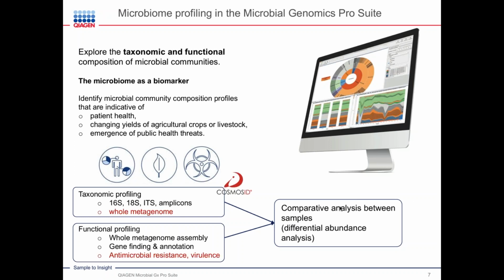We have also brought on board of our platform commercial partners such as Cosmos ID, which completes the package by providing a plugin that allows to use whole metagenome data for taxonomic profiling, and provides reference databases that allow functional profiling with a focus on antimicrobial resistance and virulence.